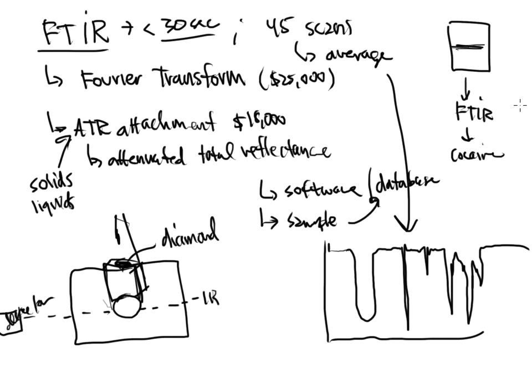I can't get quantitative data easily from it. There are efforts and papers now that are trying to use FTIR to get concentrations. I'm not saying that it can't be done, but it cannot be easily done. And that's really not what its purpose is anyway in a laboratory. We've got better things to do that with. But this is for identification purposes. That's what we use it for.